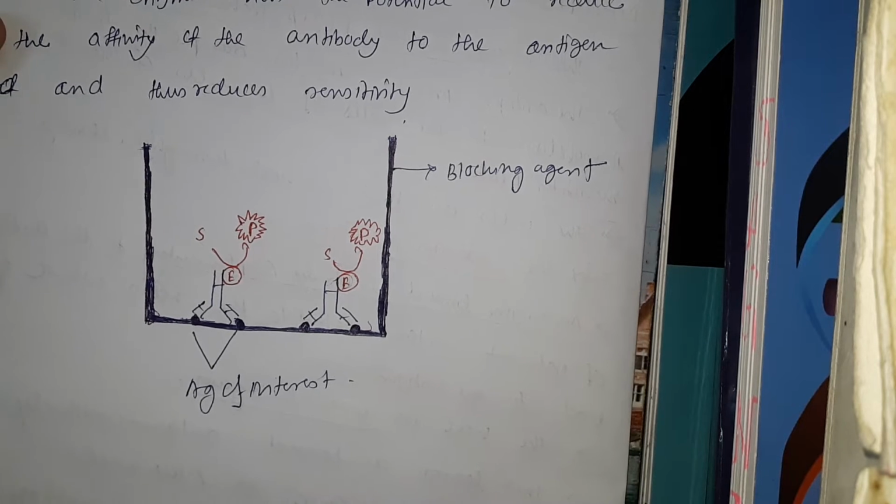This is the continuation of our previous video of the ELISA lecture series, where we have talked about the basic introduction of ELISA, what enzymes we need, the substrate that we have to add along with the enzymes, and the definition of ELISA. So today we are going to talk about what the simplest form of ELISA is. So let's talk about that.